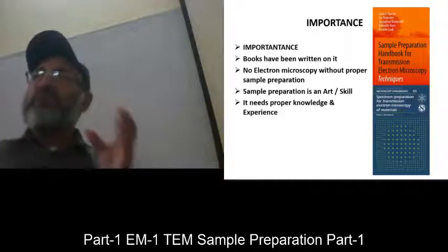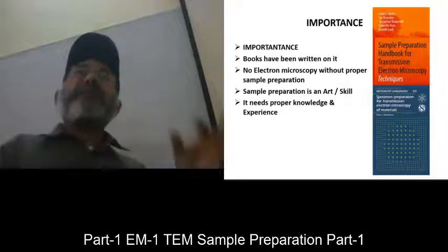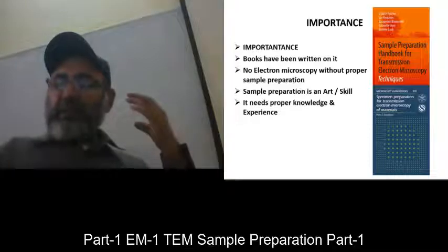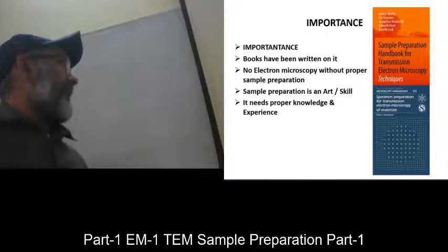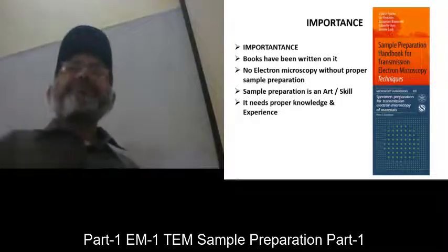So that was a huge problem, and it took decades to perfect some methods, to devise methods to go to that much thickness of the sample which would be electron transparent. So books have been written upon these.